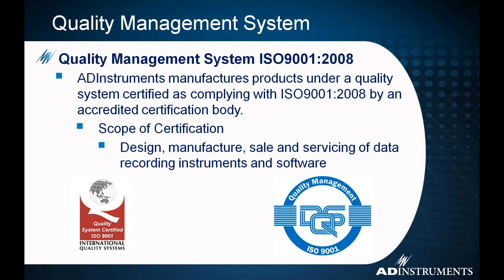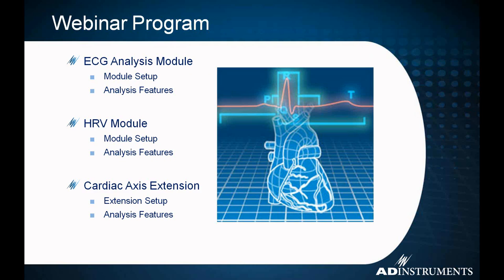They look at our manufacturing process, our validation processes, and our design processes to make sure that we're meeting current standards for the production of biomedical research equipment, and that what is being input into the PowerLab and going through LabChart is actually what is happening. The certificate for this certification is on our website, so if you have any ERB processes, you can definitely download it, because it may come up in the review.